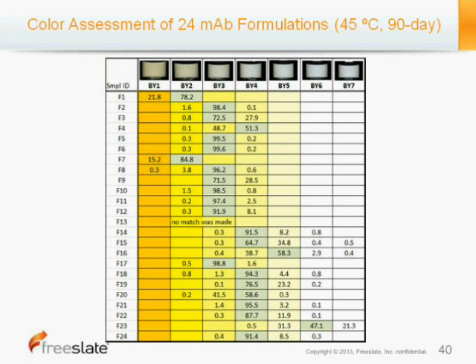And we had very good matches for formulation F2 with F5, F6, F8, and F10 through F12. There were a couple of formulations that had colors that matched the BY2 standard, which was F1 and F7. For F13, we didn't see a match for any of the colors.